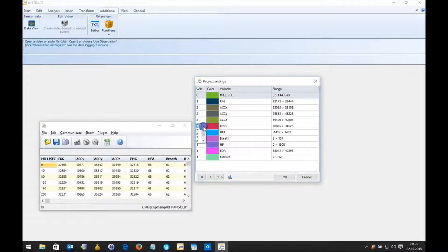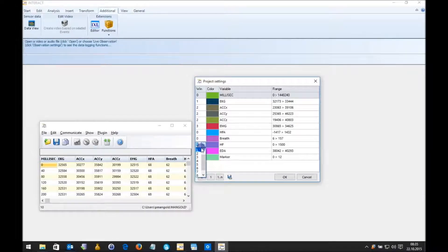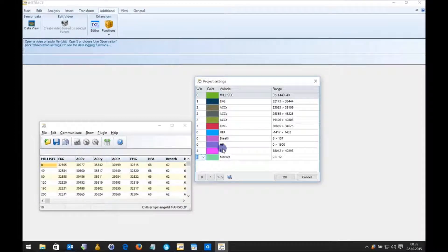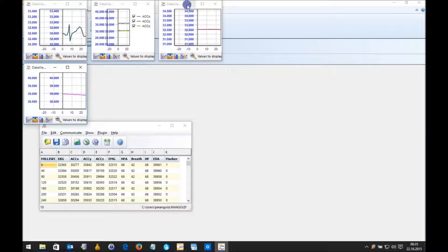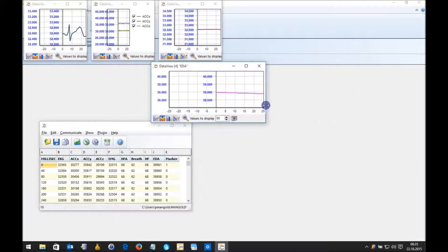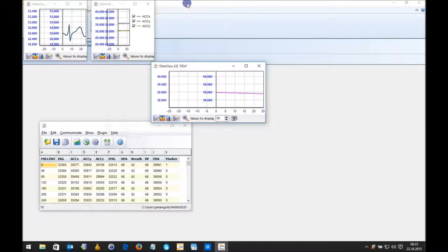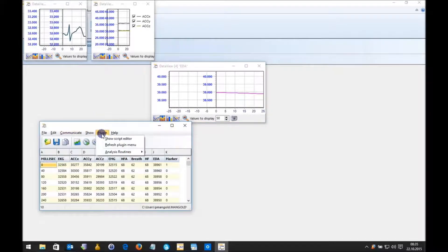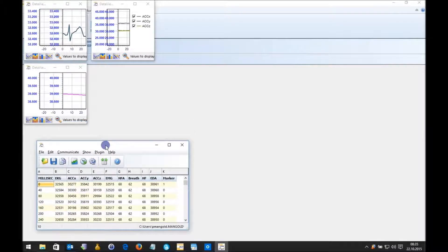My EMG value is on window 3. Heart rate frequency — I don't need that right now. The breath — I don't need that either. But the EDA value is very important to me. EDA — Electrodermal Activity, also known as skin conductance. When I say okay, I get those four windows. I can rearrange the windows, resize them, and auto-layout them at any time.